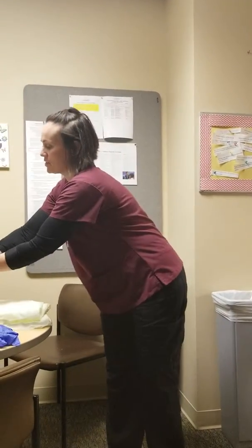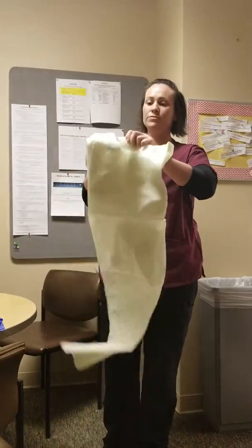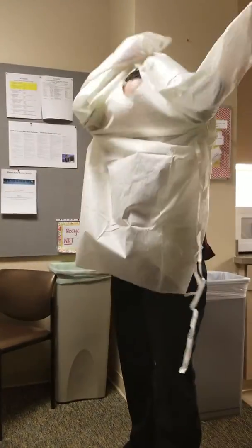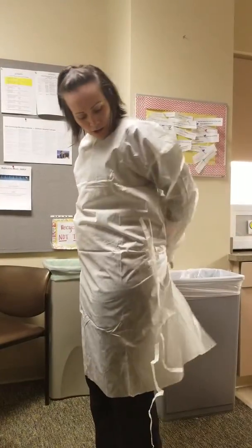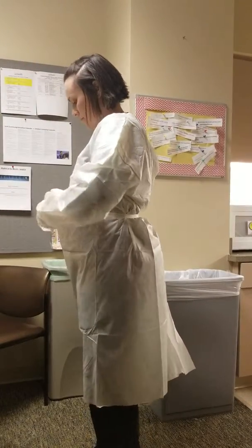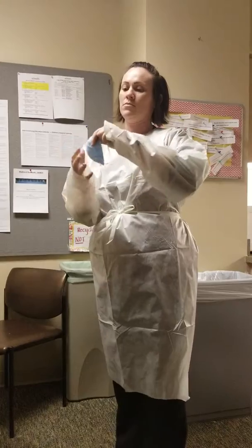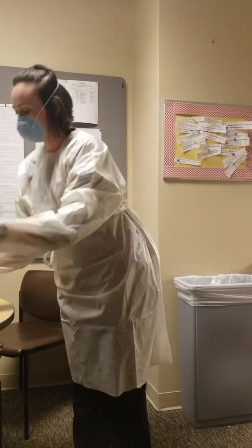Here we go. Put some hand sanitizer on. Get my gown and make sure it's secured. Put my mask on and my gloves.